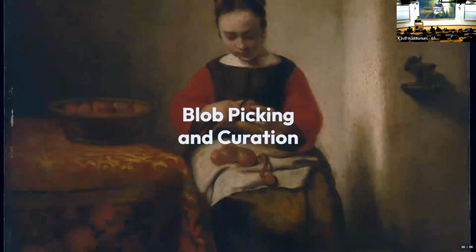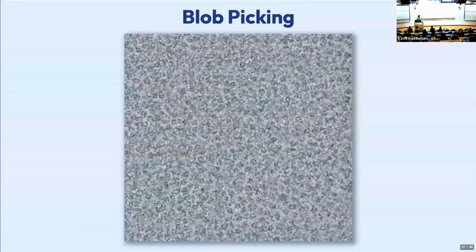So now we have our movies that we motion corrected into micrographs, and our micrographs have a contrast transfer function estimate. So we say, for this movie, we think we were at this defocus, which means we need to multiply by these values, et cetera. What's the next step? Well, the next step is we need to get our particles out, right? Here's our micrograph. I can point and say, look at all those blobs. But we need a way for the computer to know where these particles are so that we can use them to make our 3D map, right?